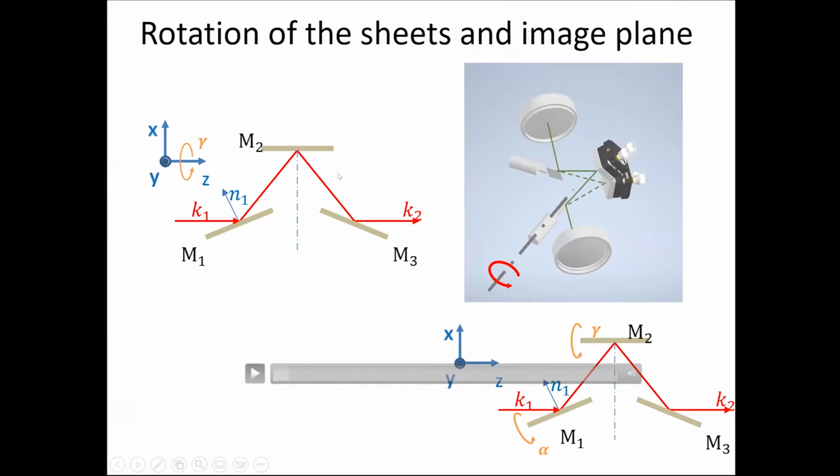galvo mirrors. And instead of having a mirror here that rotates, we could have 2 or 3 or more static mirrors at different rotation angles. And with the galvos, we would essentially select which mirror we would go. And as such, we could create discrete rotation angles that looked very straightforward on paper, but was also very wrong.